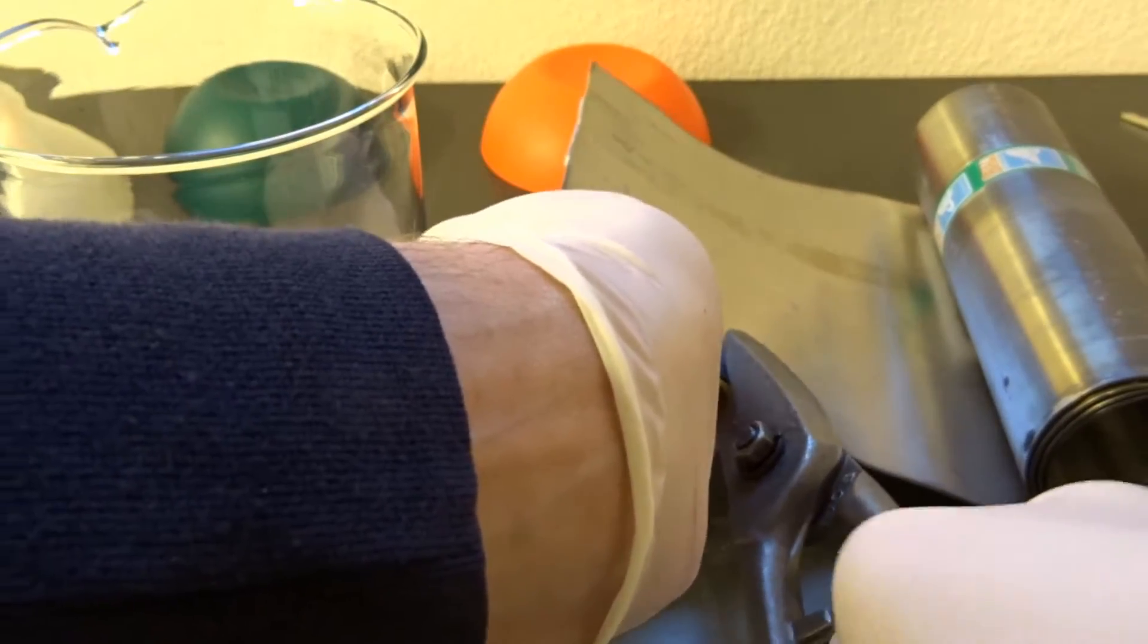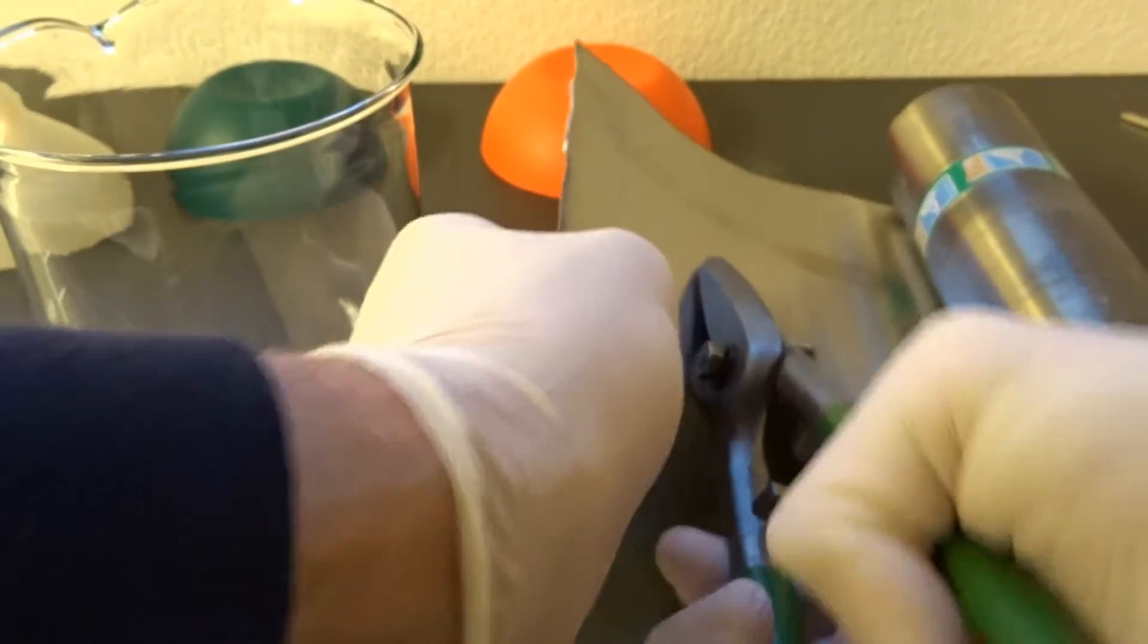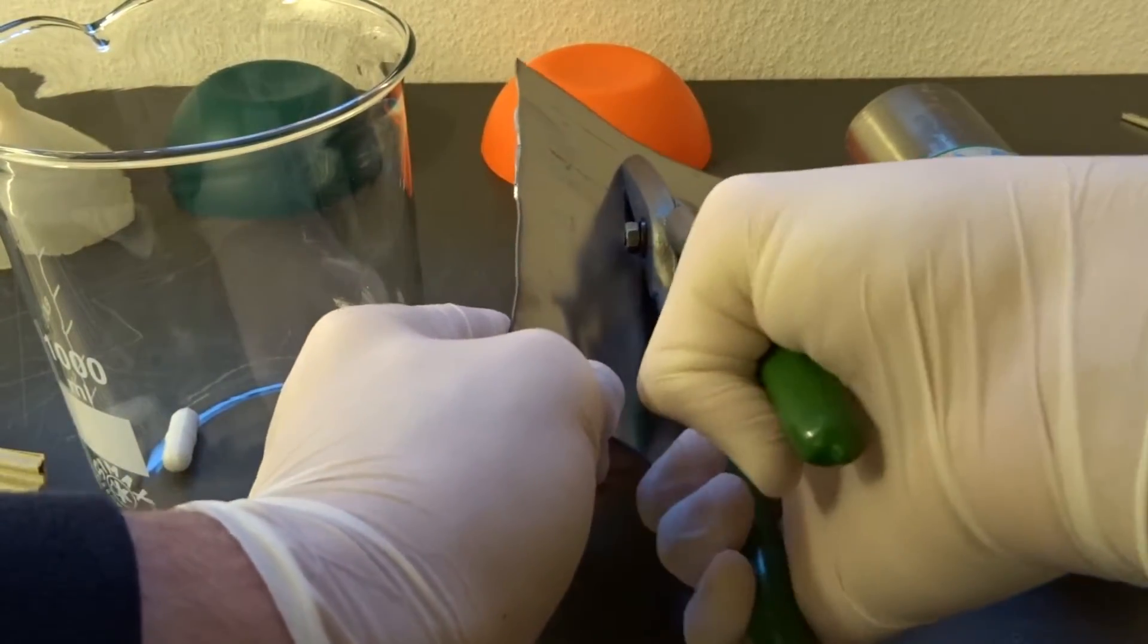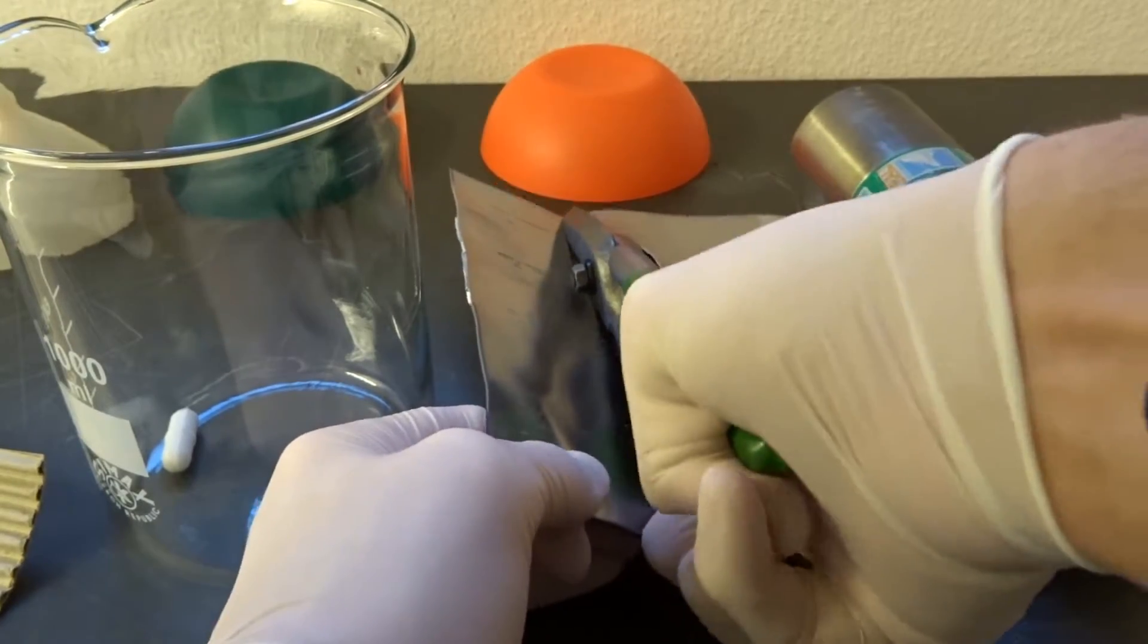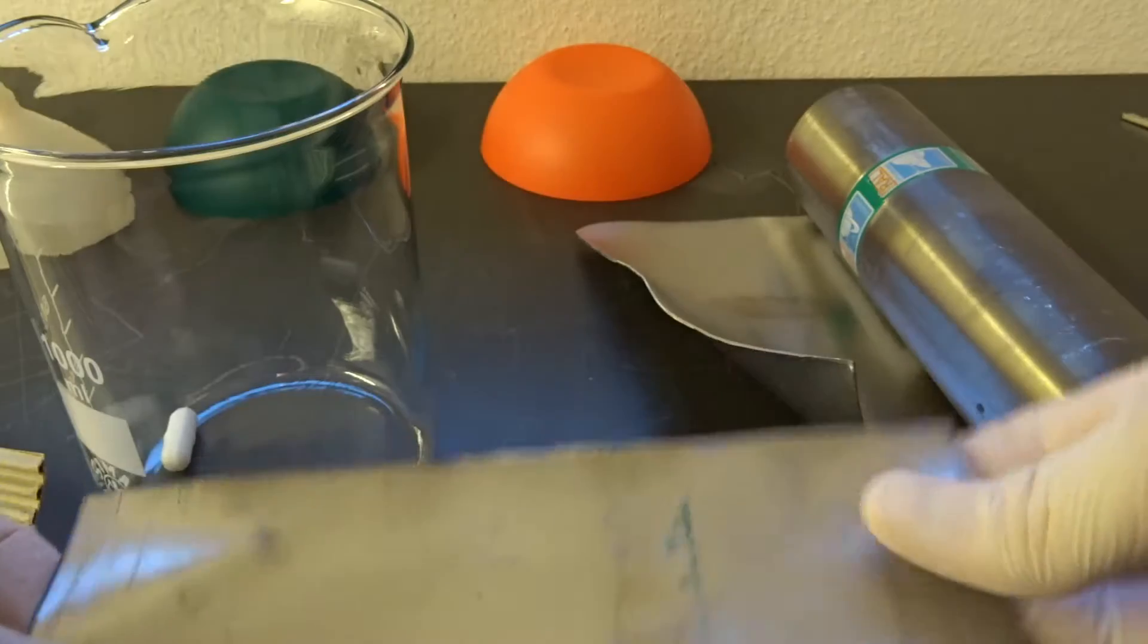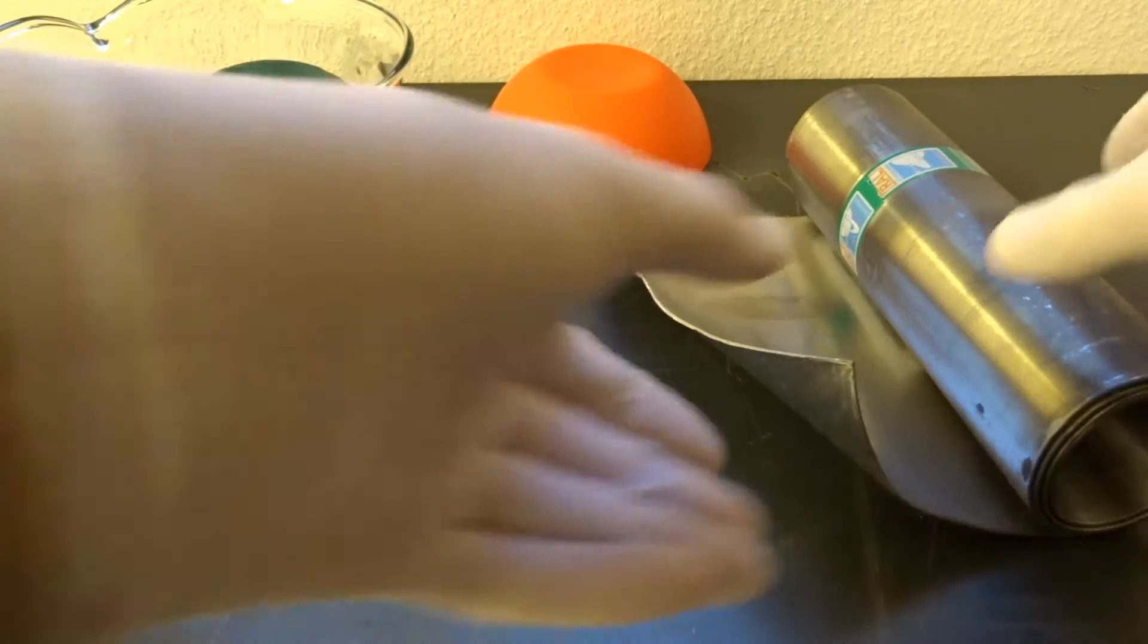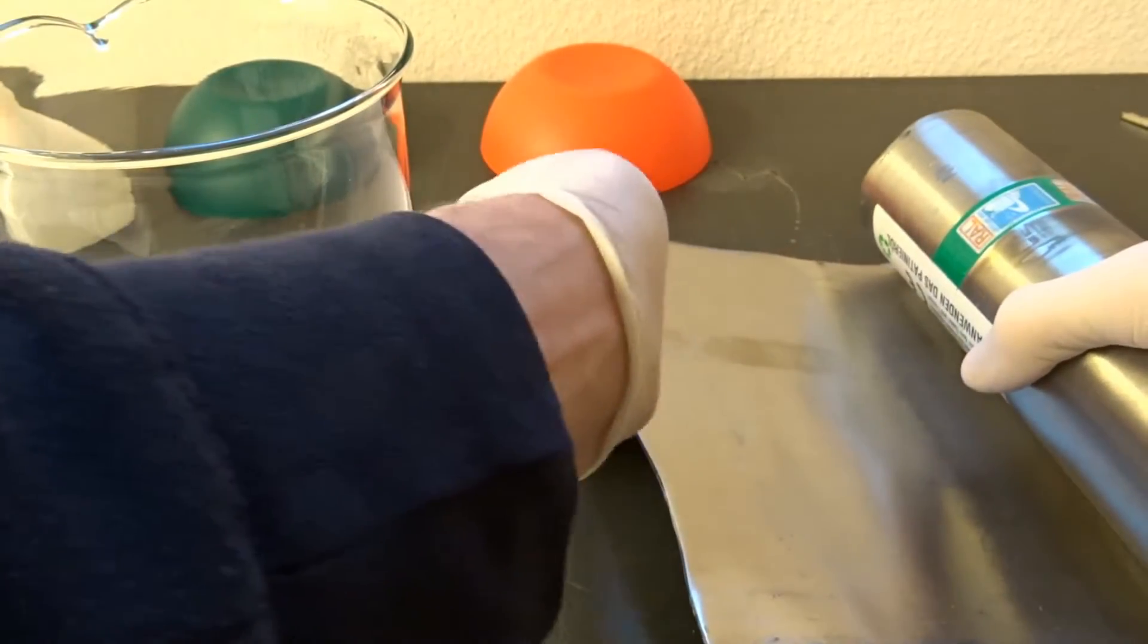This metal is super soft, really cuts like butter. I'm wearing gloves today because my hands are wounded and I don't want to get any lead inside them. Here we have our first electrode. I just need to remove that piece of paper, and I'll quickly cut off a second one.